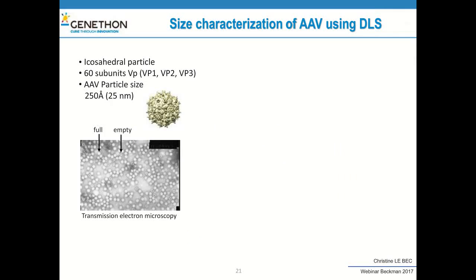So before, I told you previously that the motion and the boundary motion will depend on the shape of your product and on the molecular weight of the product. And for that, we also control that we do not have any difference in terms of shape between the full and empty particles. First of all, we do microscopy analysis just to see that we do not have any difference.